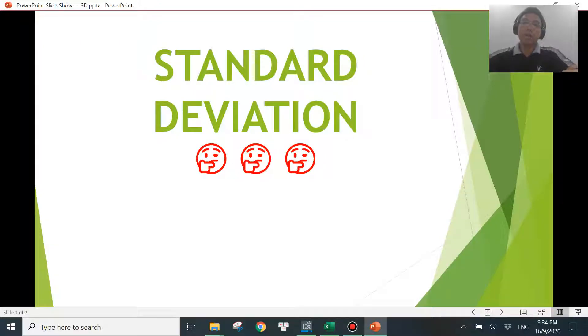Hi there. In this video I'm going to show you a tip to calculate standard deviation values that you can apply right now.